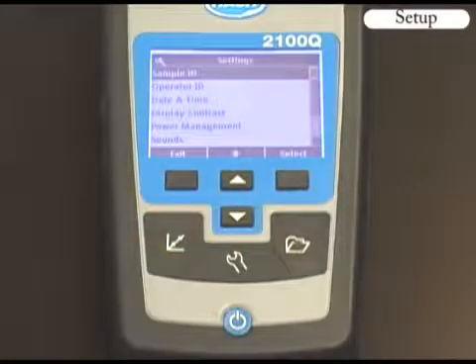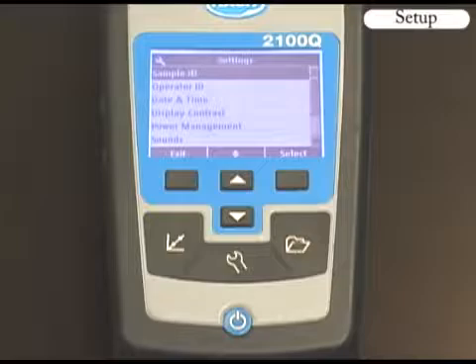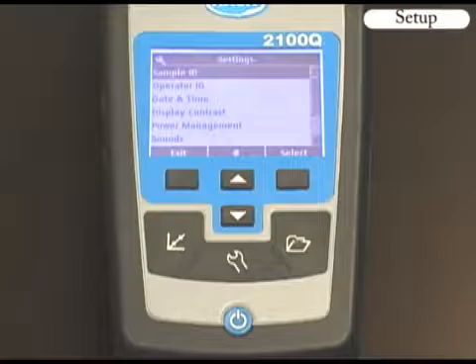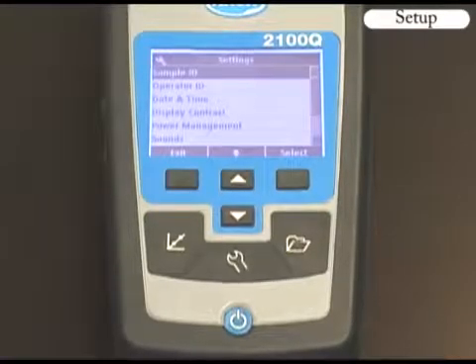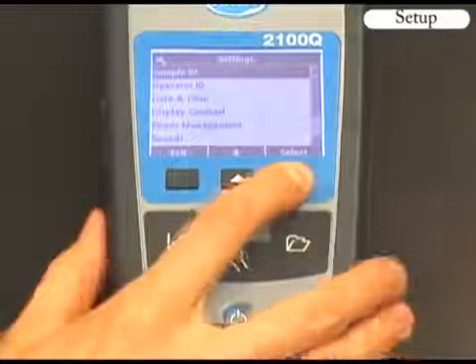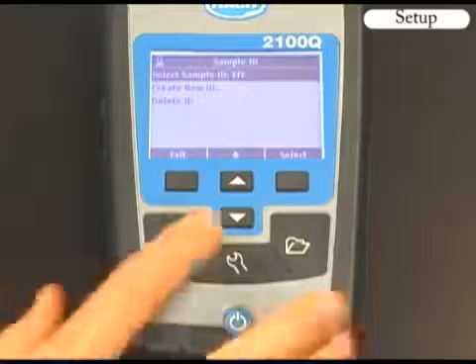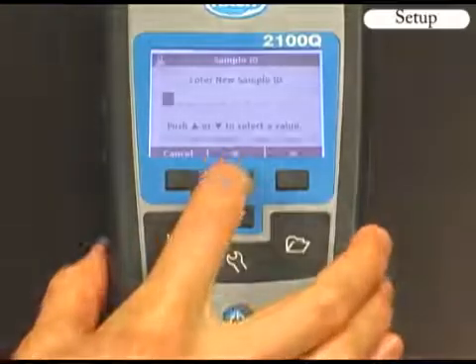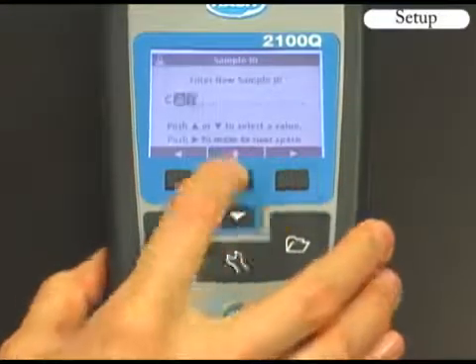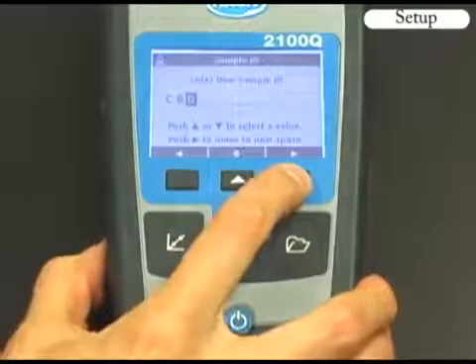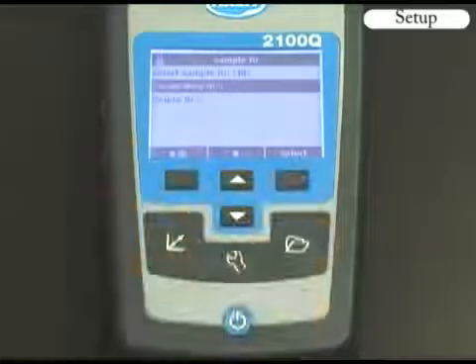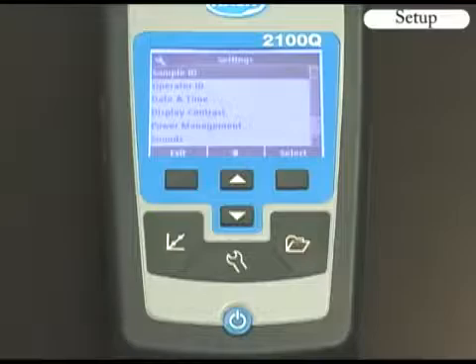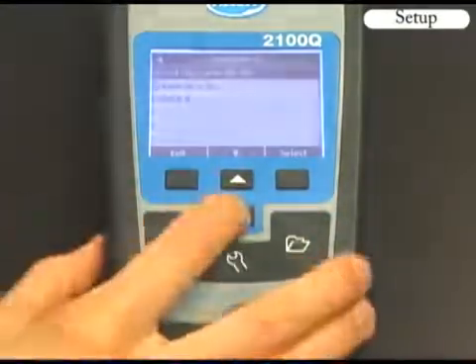Press the settings key for meter setup. The 2100Q gives you the option of assigning a sample ID and operator ID to associate readings with a particular sample location or individual operator. Scroll to highlight sample ID and push the right key. Select Create New ID and enter the new sample ID using the up, down, and right arrows. Press the left or exit key to return to the settings menu. Now I will use the same key functions to create an operator ID.